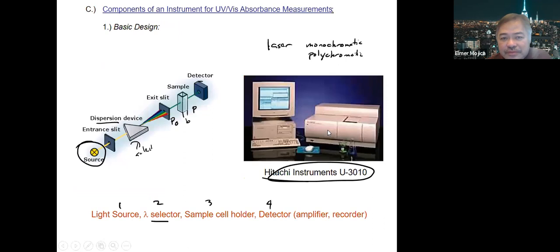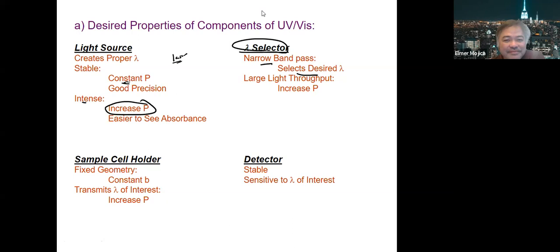Okay, so you could see if the power will pass through the sample, because what absorbs the incident beam? Anyone? Anong nag-absorb sa incident beam? Yung sample po. It's the sample. Now imagine if the incident beam is not powerful enough. So baka pag ano lang doon, sa gitna lang ng sample, hindi na siya nag-emerge. Okay? So that's the reason why you want your beam to be powerful.